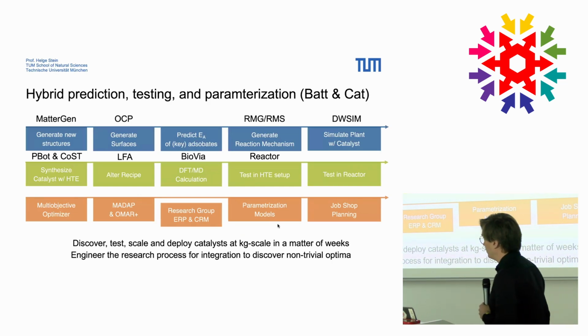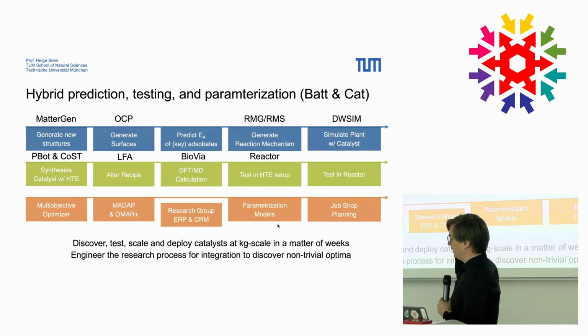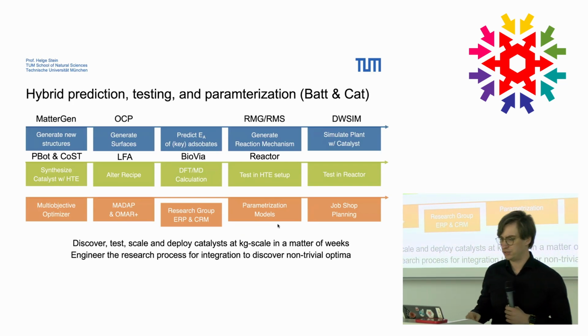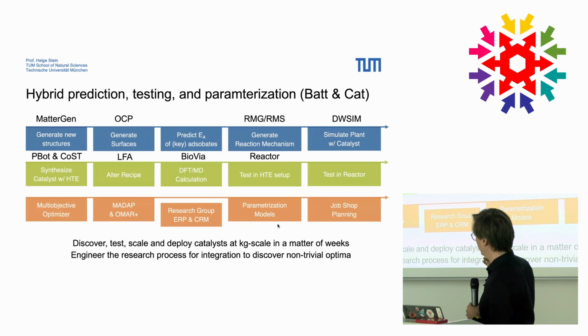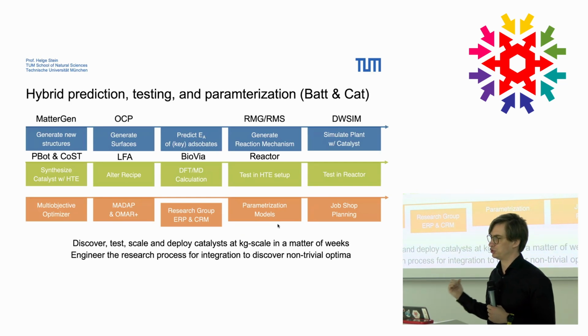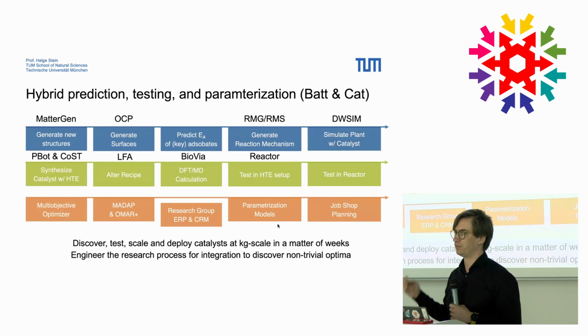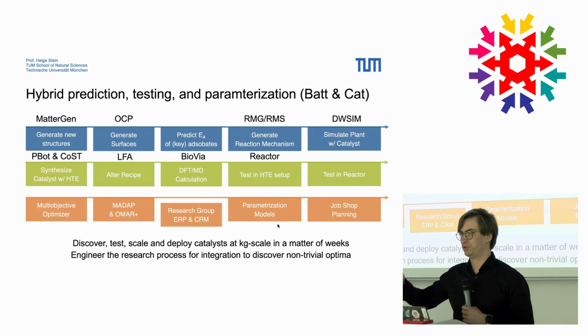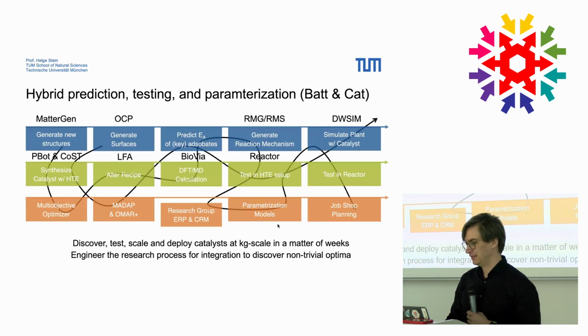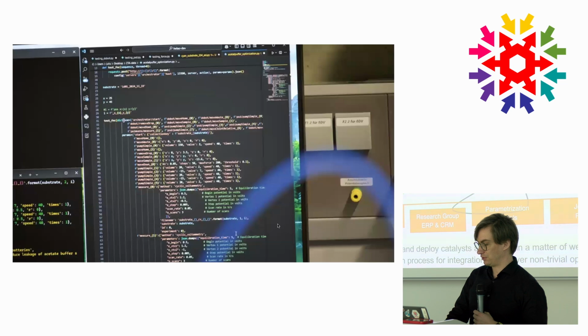We are very actively in the process of not just doing lab automation and coupling this with simulations. We are also trying to bring in the whole business process modeling side of things, such as job shop planning, meaning that we can really go towards 100% machine utilization without, let's say, stressing out. And this is all very intertwined.